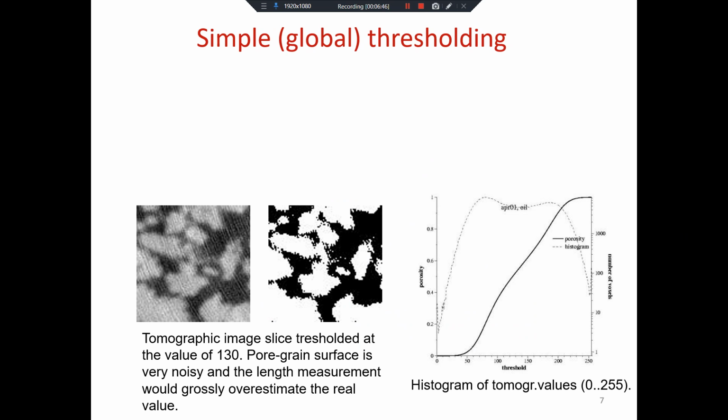Now, if I have a bad image, and this is my quintessential example of a bad image, this is my own frustration from my PhD when images were not as good, okay? Then all of the noises, so for instance, here we have ring artifacts and they're messing with my identification. My eyes see relatively smooth surfaces. And I actually know for a fact that polyethylene should be smooth. Those grains are pretty smooth. They're a piece of plastic.